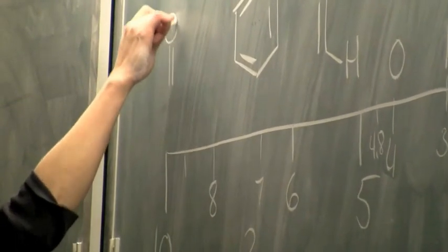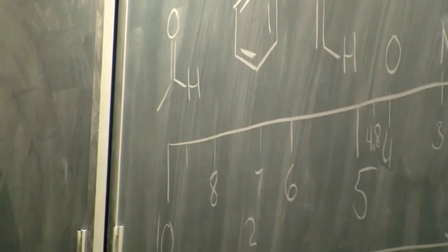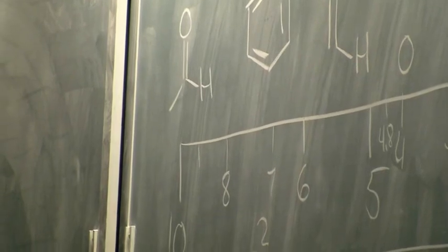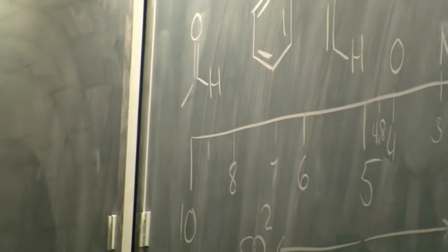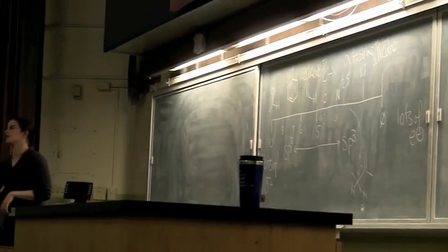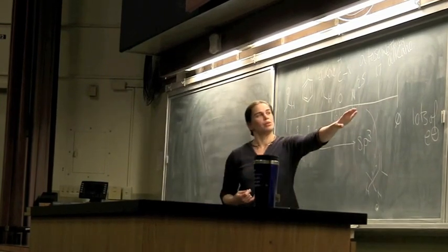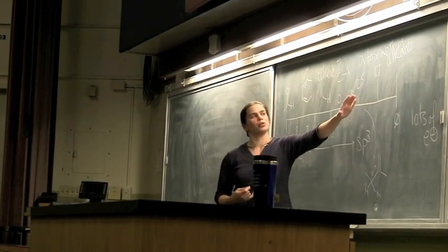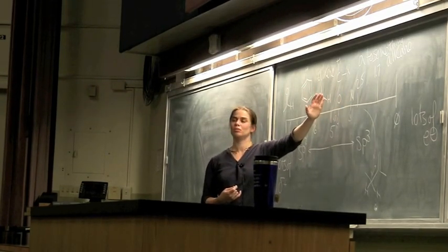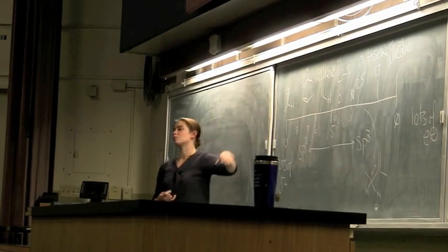You start trying to add in really electronegative atoms, there's your aldehydes, way down there at 9.5, 10. Really, really deshielded because we're not only sp2, we've also got that really electronegative atom. Oxygen pulling on those electrons, stealing them all away from carbon. Carbon's got a giant partial positive charge. And again, we're saying really what we're doing, sp3 getting more and more deshielded, more and more partial positive. Switch to sp2, pretty formal, more and more electron withdrawing, more and more partial positive.